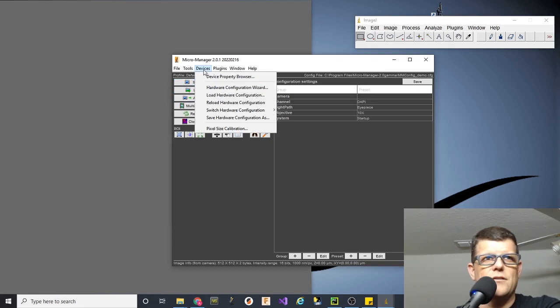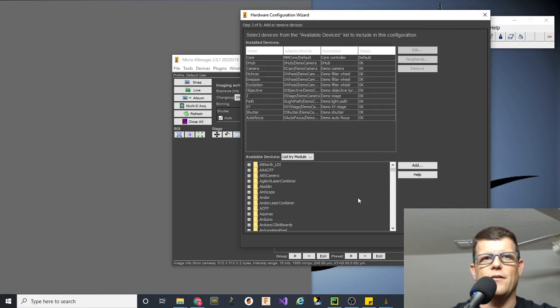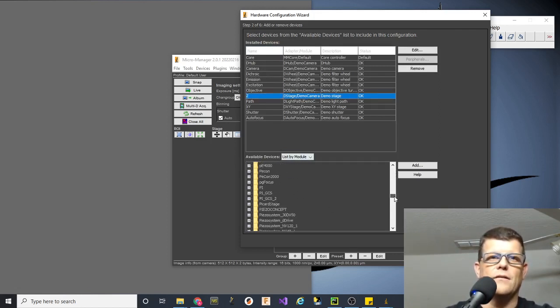Next, I'll go to the devices menu and I'll select the hardware configuration wizard. Now, I'm going to assume we'll pull down a couple of DAC channels, and we'll assume that one of those DAC channels will be a Z motor control. So we'll go ahead and modify the demo file here. That'll keep everything already set up over here. We will have this demo stage camera to deal with. That's okay. Next, I'm going to go down and I'm going to find the Triggerscope.